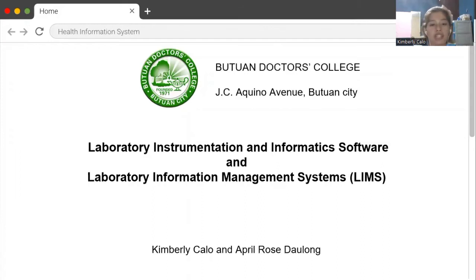So good day everyone. Today Ms. Daolong and I had the opportunity to discuss laboratory instrumentation and informatics software as well as laboratory information management systems or the LIMS. First, I will be going to discuss the laboratory instrumentation and informatics software or the laboratory informatics.